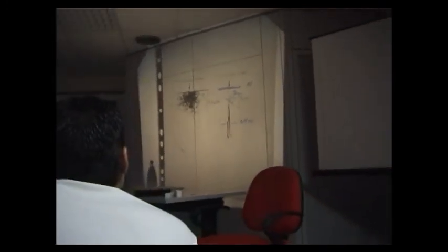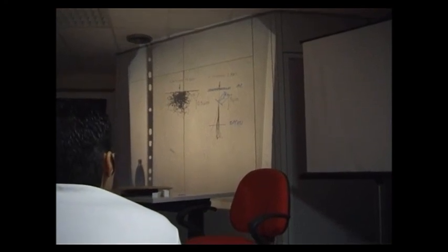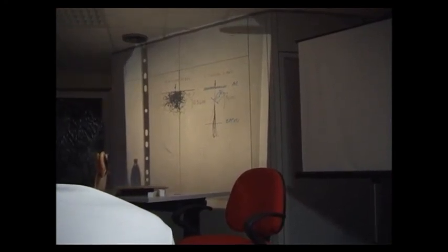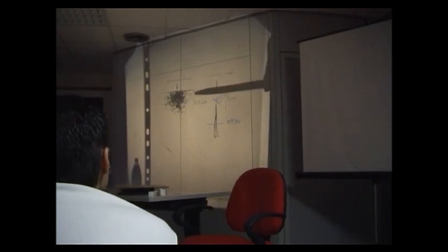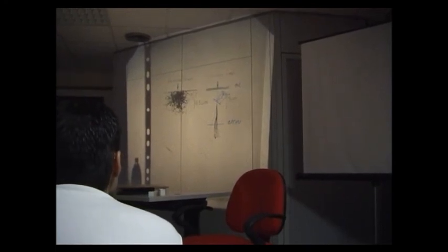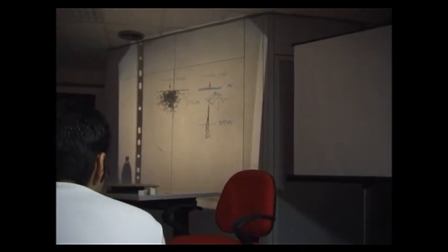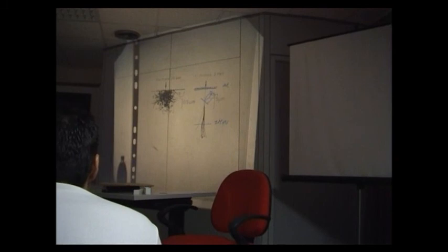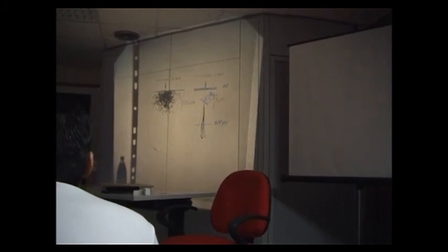If I take again this kind of representation, I can say that if we send protons in vacuum and we put at the end of the accelerator a thin foil of material, a very thin one, about a few microns, we use mainly aluminum foil. I will give you the reason in a moment.